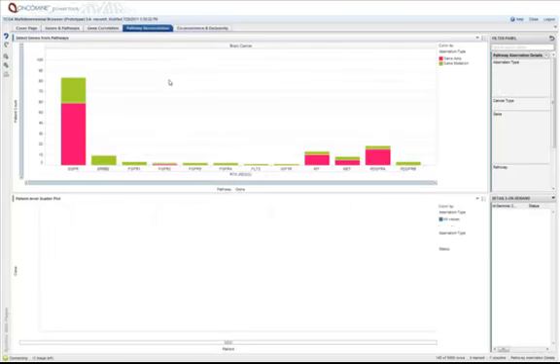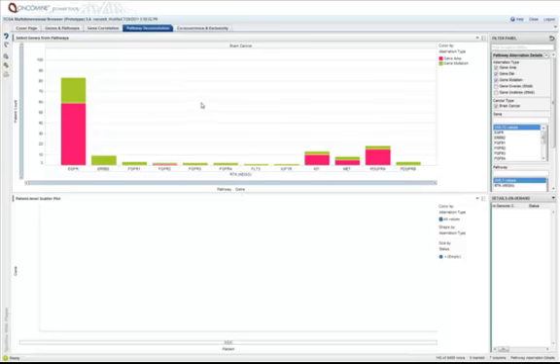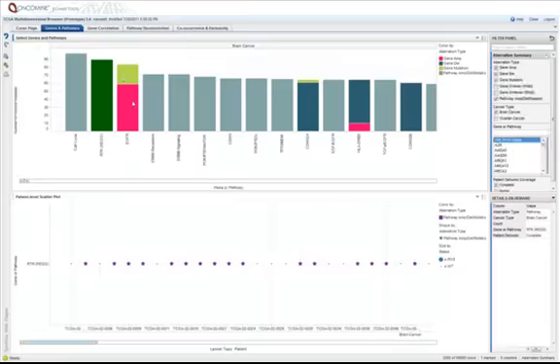What we can see here is something that was reported in the paper, PDGFRA amplifications and mutations. But also, I'll point out rare amplifications and mutations in other receptor tyrosine kinases, like FGFRs and HER2 and others. So that's one aspect of an integrative analysis, is looking at the pathway level. We can also look at the gene level.